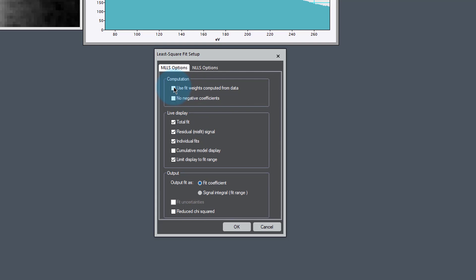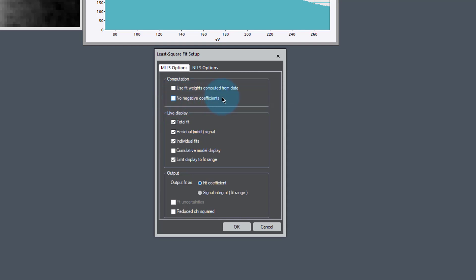No negative coefficients restricts all of our fitting to positive values. We know we can never have a negative EELS spectrum, so by having no negative coefficients, that forces all of our EELS spectrum to be positive. Now we're actually fitting backgrounds too. In the backgrounds, sometimes you want to have negative coefficients. So in this case, let's turn off that negative coefficients.